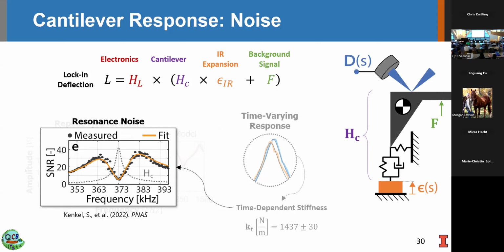So this is one of the primary issues: there's a trade-off between the sensitivity and this artifact, which creates a lot of extra noise and limits our ability to perform nanoscale chemical imaging of very thin sections, essentially our epoxy embedded cell sections.